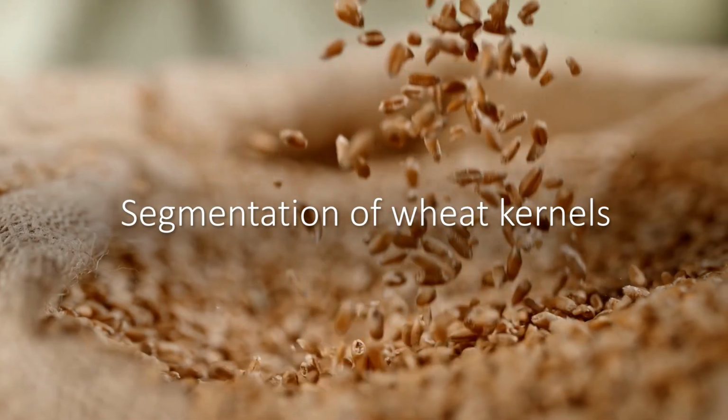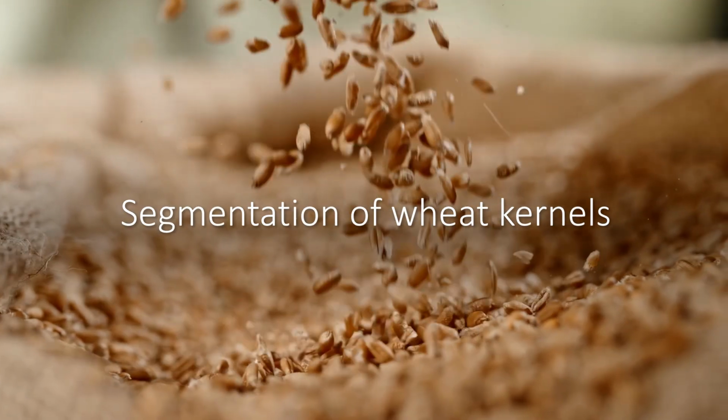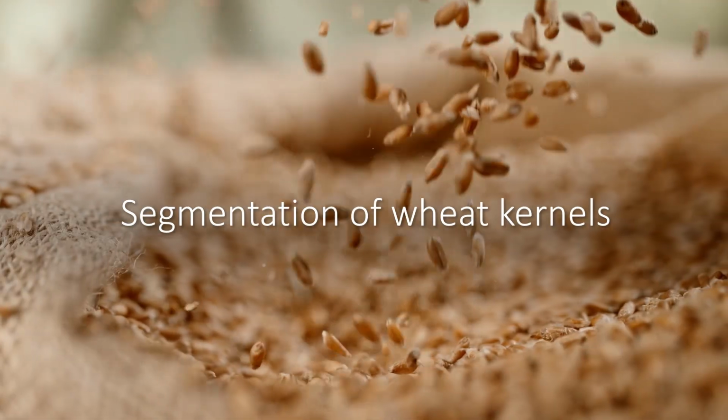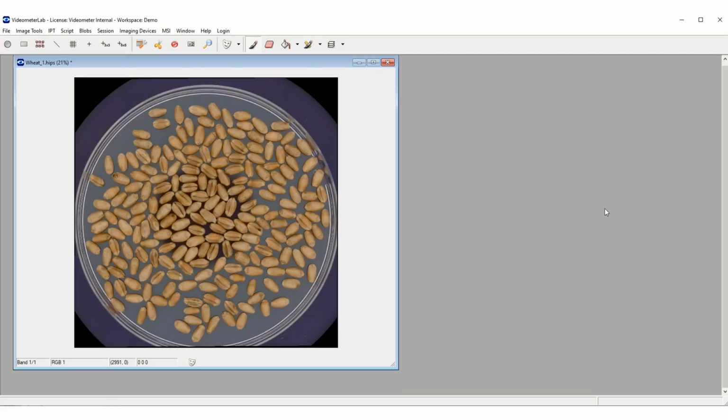First we will go to segmentation of wheat kernels in a petri dish and show you all the steps involved. Here we have a petri dish with wheat kernels, and we want to be able to segment out the wheat kernels from the background of the petri dish so that we can focus on just the wheat kernels. In order to do this, we first create contrast between the wheat kernels and the background, and we do that with our transformation builder.